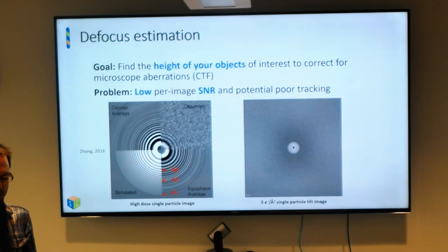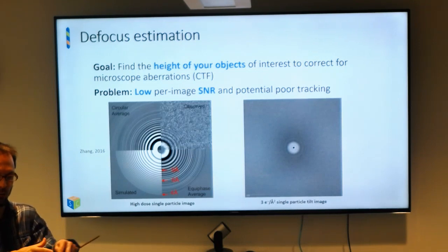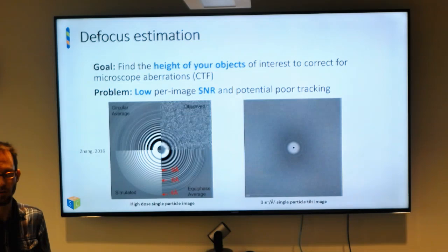As long as you can get stuff aligned such that you can pick your particles, then you should be able to go to, I'll talk about quickly, EM Clarity or Warp or EMAN2 to do a sub-tilt series alignment. Then after you do sub-tilt series alignment, it doesn't matter where you start your sub-tilt series alignment, because you're doing those little refinements and you're going to get effectively to the same place. The same thing.